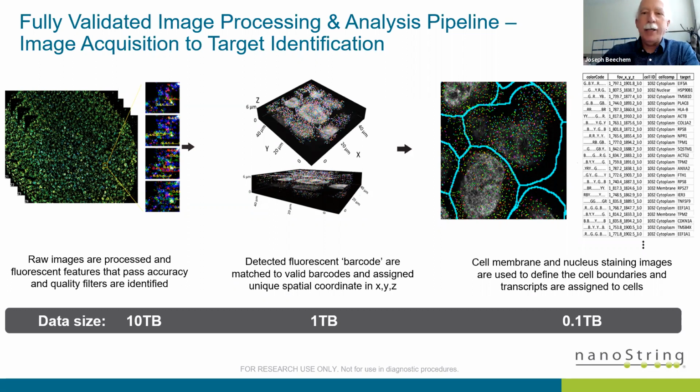The location of where that RNA is, in cell number 1938 or 1205 or 304,003. They're all indexed that way, where they're at, cytoplasm. Your actual data set gets down to a pretty manageable thing, down to about 1/10 of a tera. Okay, I see another one, a good question in there that I'll get to. 1/10 of a tera. But anyway, that's sort of the cycle of data through the system.